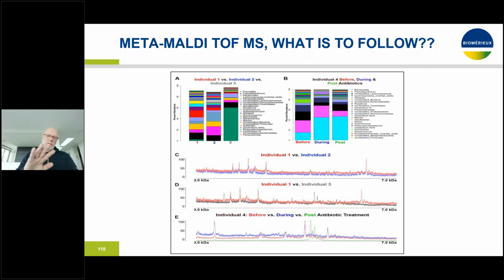And there you can look at the species, but you can also do metabolomic analysis using mass spectrometry. And we've been able to show in mice, for instance, that both at the microbiome level and at the metabolome level, if you treat bacteria with antimicrobials, then the complexity goes down. If you take away the antimicrobials, in most cases, but not all, the flora rebalances again, and also the metabolome becomes more complex and more alike the pre-antimicrobial treatment metabolome.